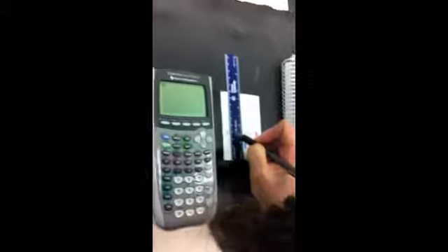So after you've let your TLC plate dry, we can now find the retention point for each of the dyes. Now in the 1:1:1 solution, we find the solvent line, which is around 4.5. After we find the solvent line, we measure to the center of the dye mark.